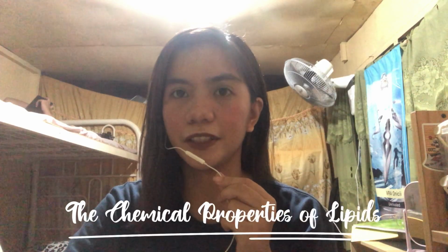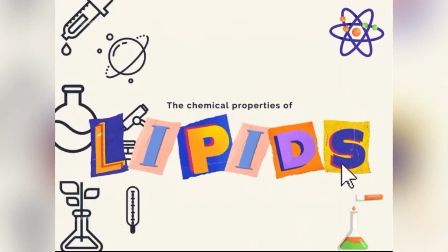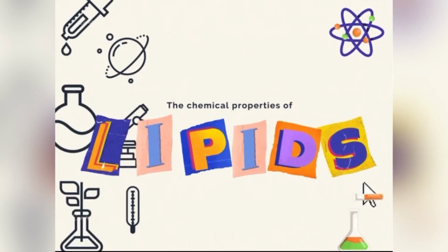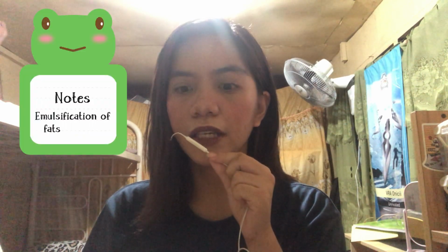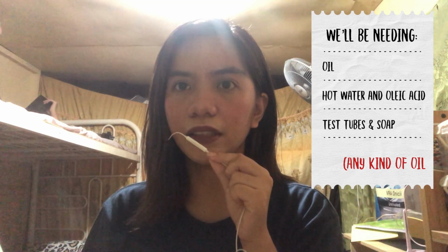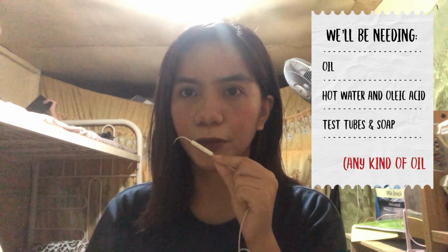And now we are down to our last topic. My name is Shaina Amparo and I'll be discussing the chemical properties of lipids. For our first experiment, it is called the emulsification of fats and oils. So we'll be needing coconut oil, corn oil, margarine, oleic acid, and detergent or soap.